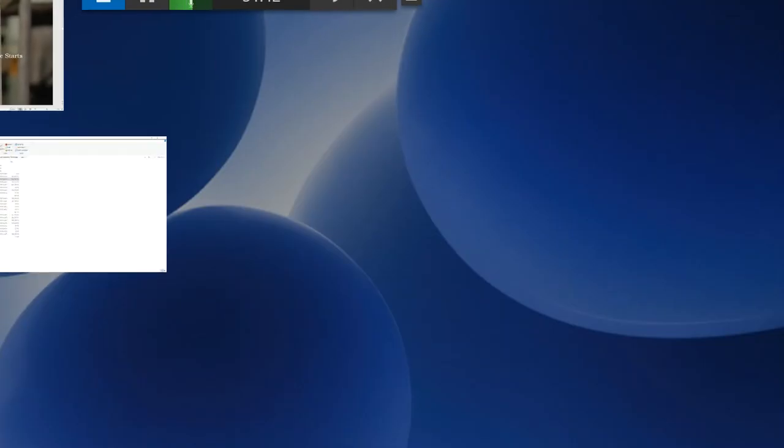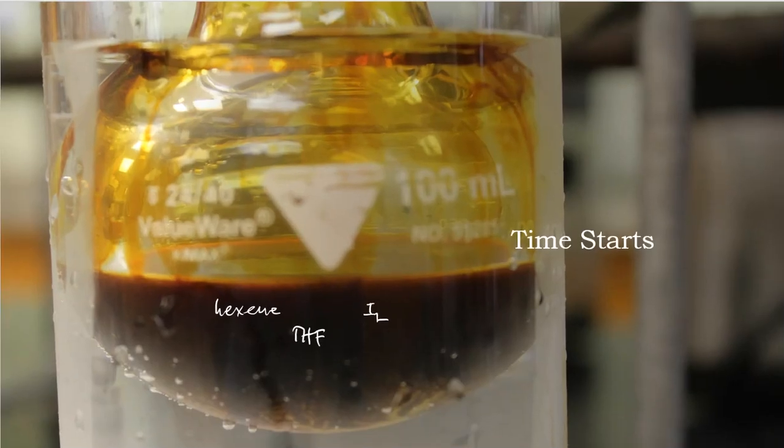And your sodium borohydride. So this is my BH3 that's required for an anti-Markovnikov addition if I can get one to go forward. All of these folks swimming around in my flask, pretty as you please, on a hot summer day by the poolside. They're just all together having a grand old time. I hope they've got metal cans and not glass bottles.